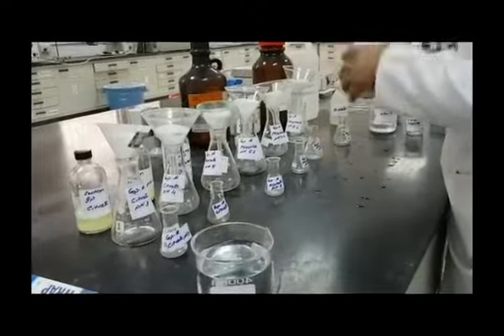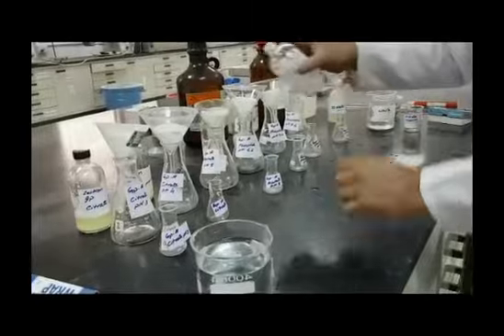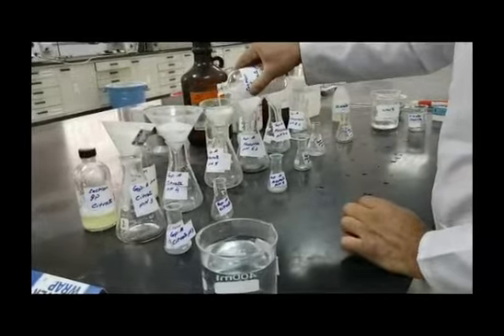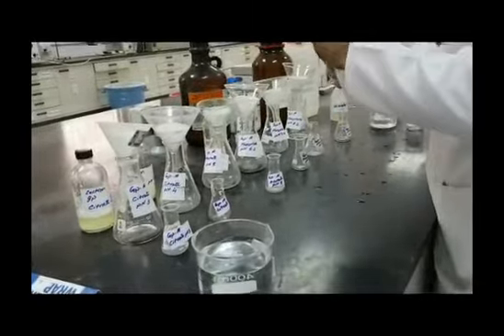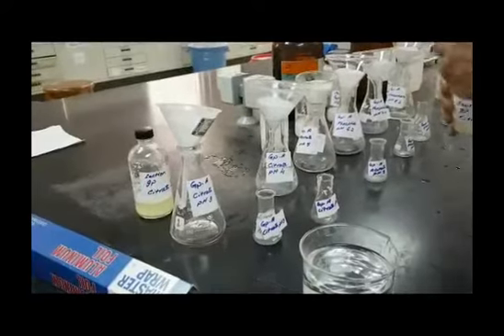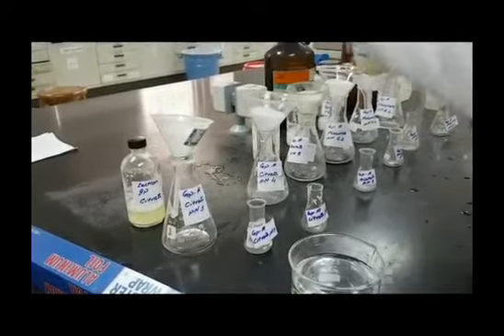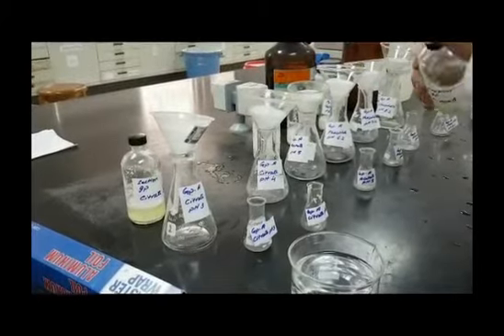Why? This is due to the fact that this portion will have lower concentration than the real sample concentration, as part of the sample material will be absorbed on and in between the filter paper fibers.